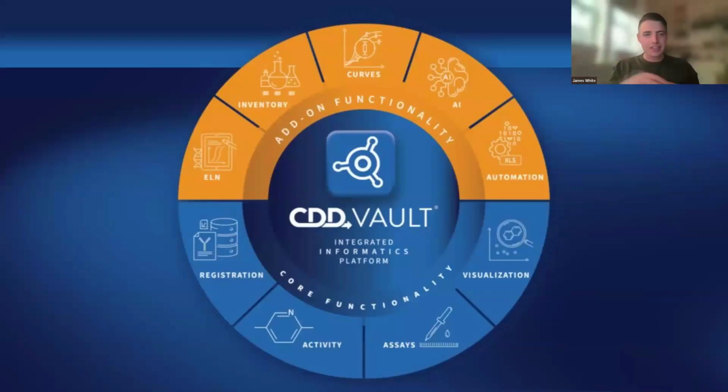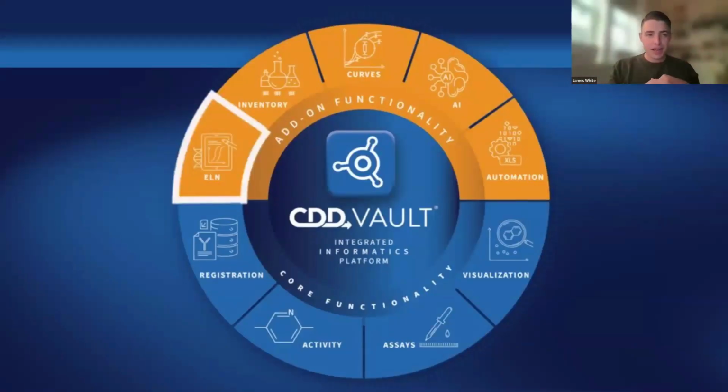Next, we're going to be moving into the chemistry ELN workflow enhancements. So we're increasing efficiency and consistency here. You're going to have streamlined reaction setups with clearer input fields and automated property carry through, enhanced integrations between reactions and registered entities, so you reduce those duplications of effort that you might be experiencing.